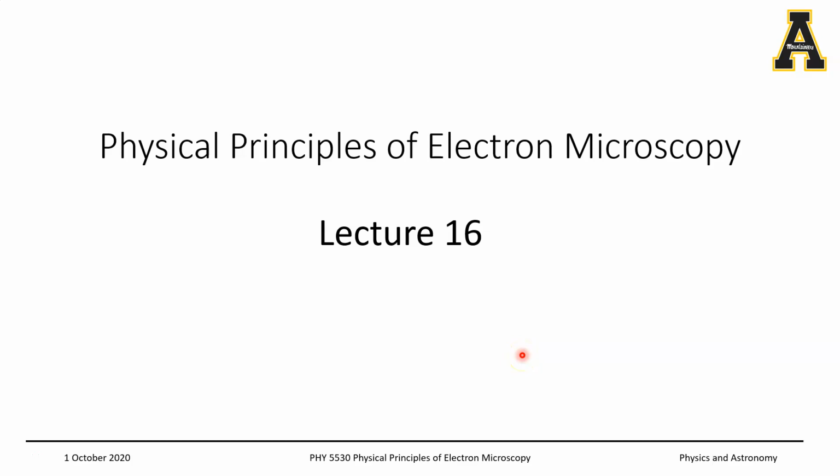Hi everyone. Today we are going to talk about vacuum pumps and the vacuum system that goes into generating the ultra high vacuum conditions that are necessary for both the scanning electron microscope and the transmission electron microscope.